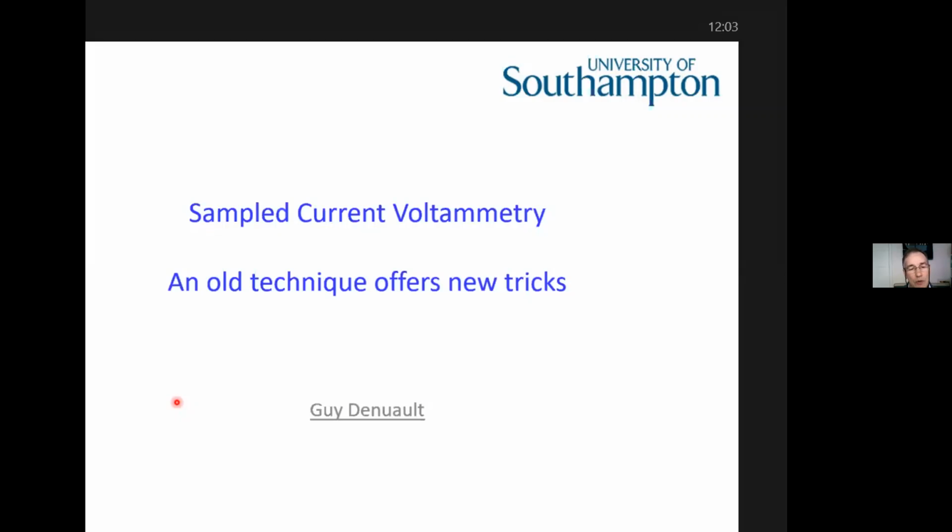So what I want to present is some of the work that we've been doing using sample current voltammetry. It's an old technique, but I think it has offered some new opportunities, hence my title, An Old Technique Offers New Tricks.